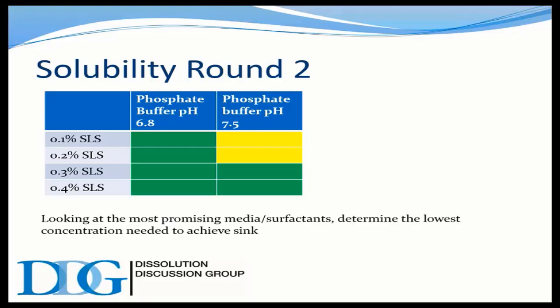Okay. There is a question out there, I see. Ken, can you read that? Yeah, it says if pH equals pKa, we call it 50% drug in ionized form and 50% of drug unionized. When there are 3 different pKa values mentioned, which value should we refer to?